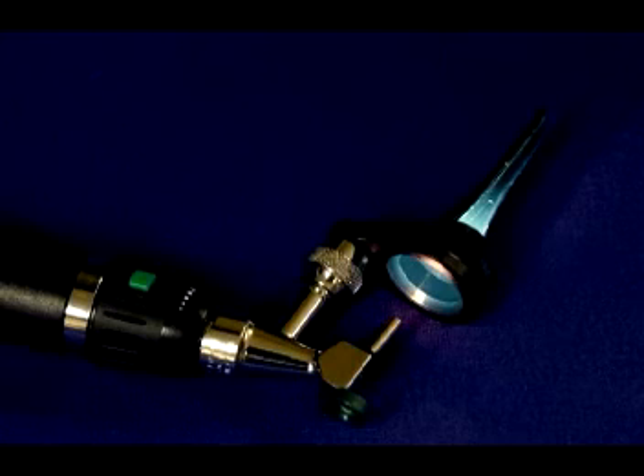The speculum is specially molded with a cutaway portion and is autoclavable. It will fit either a Welsh Allen or an MDS operating otoscope head. The otoscopes and handles do not come with the intubation pack because many of you already own one or both. If you do not, they are available from Hallowell EMC.